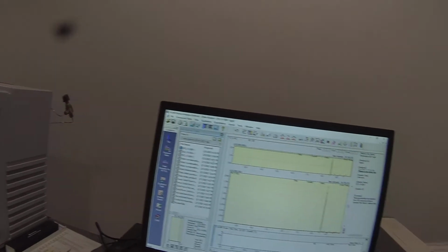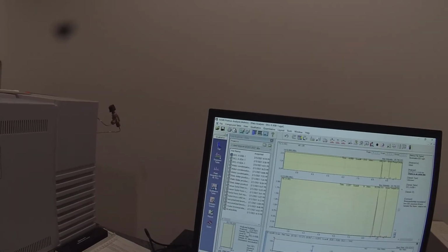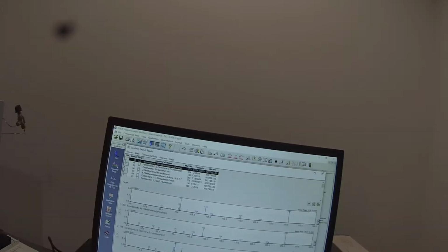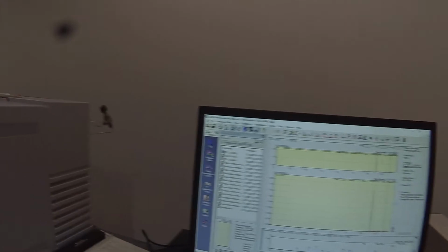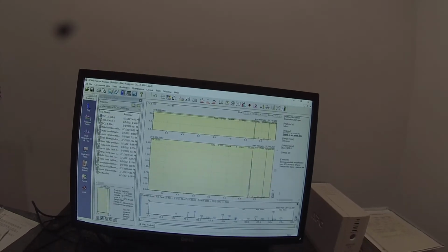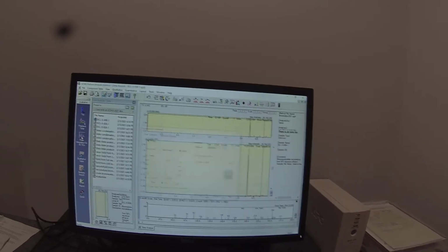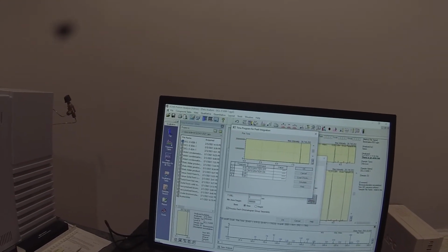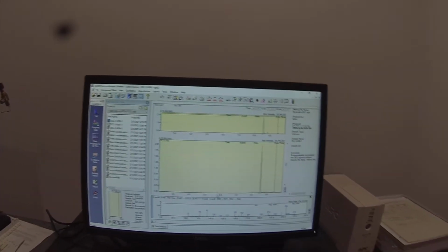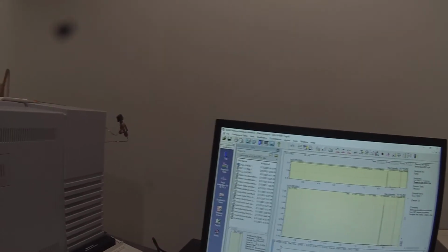And then 65B really has only that one peak. We can go on here and see if it looks like anything matches. 68% for the best match, that's terrible. And this one out here, 59% for the best match. So these peaks are not going to be detecting anything. There's no real point integrating them under those circumstances. So we'll put that integrator off back in at number 9 so we don't have to see those peaks, and save that data file.